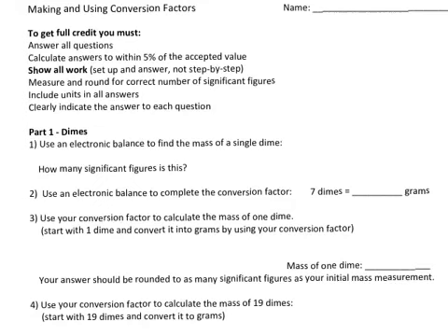Let me explain how WebHelp works with labs. I'm going to give data that is not correct. So let's say I measure the first thing, I use my electronic balance to find the mass of a single dime. So you should have found something different than this.